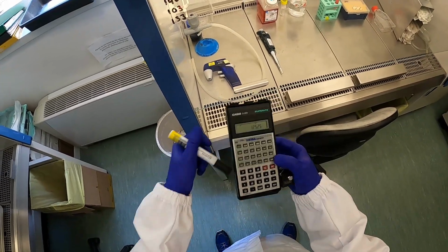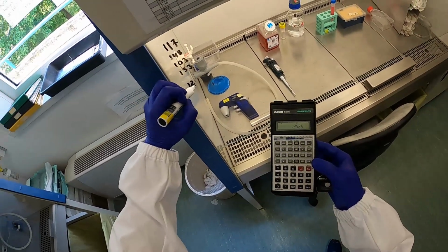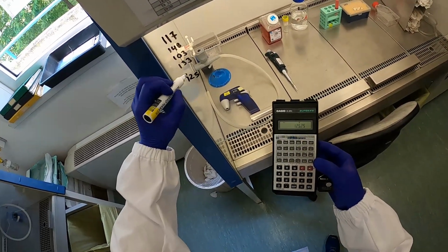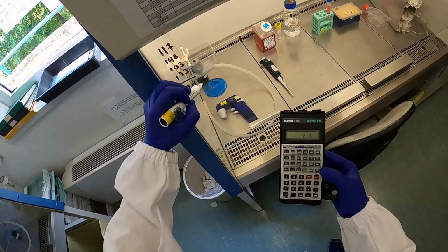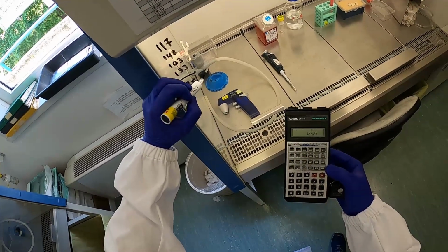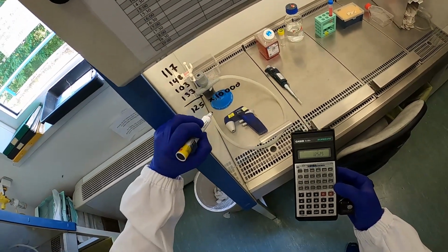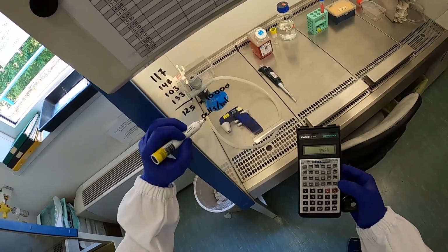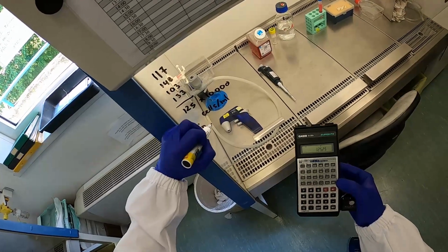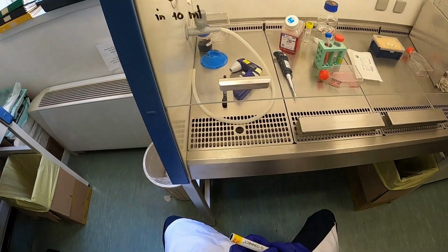How much is that? Okay, 125. So how many cells do we have per ml? Indeed, times 10,000. So we have 125 times 10,000 cells per ml, which is 1.25 million cells per ml. And that sits in the 10 milliliters of cell suspension in your tube.